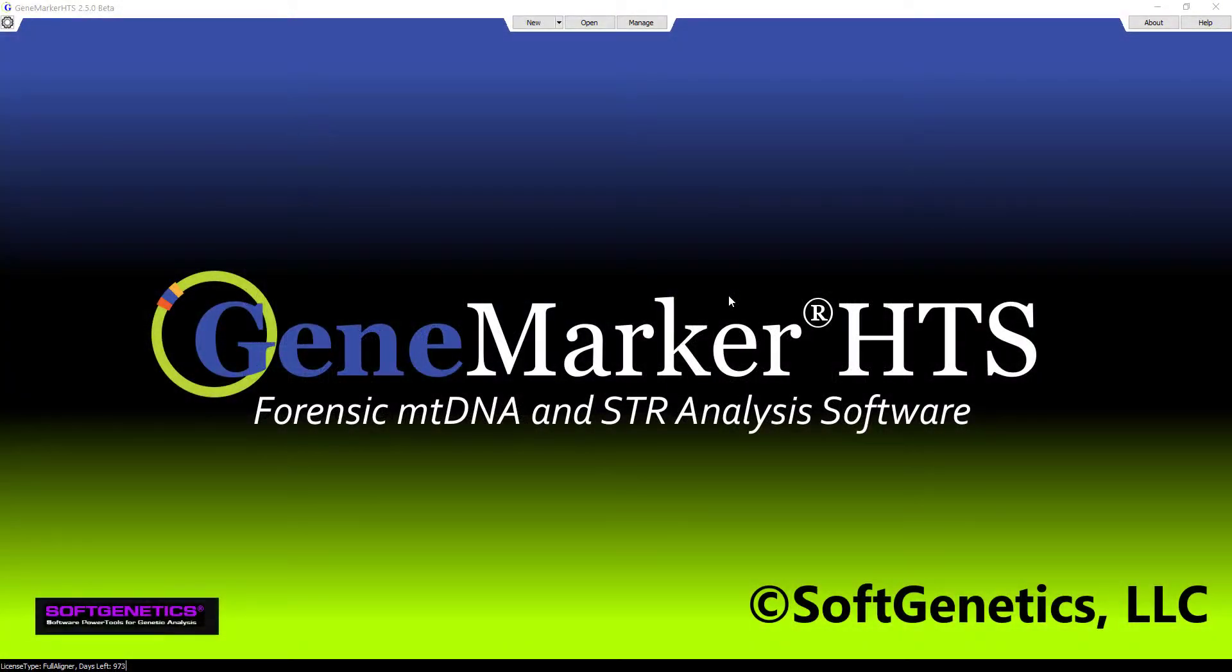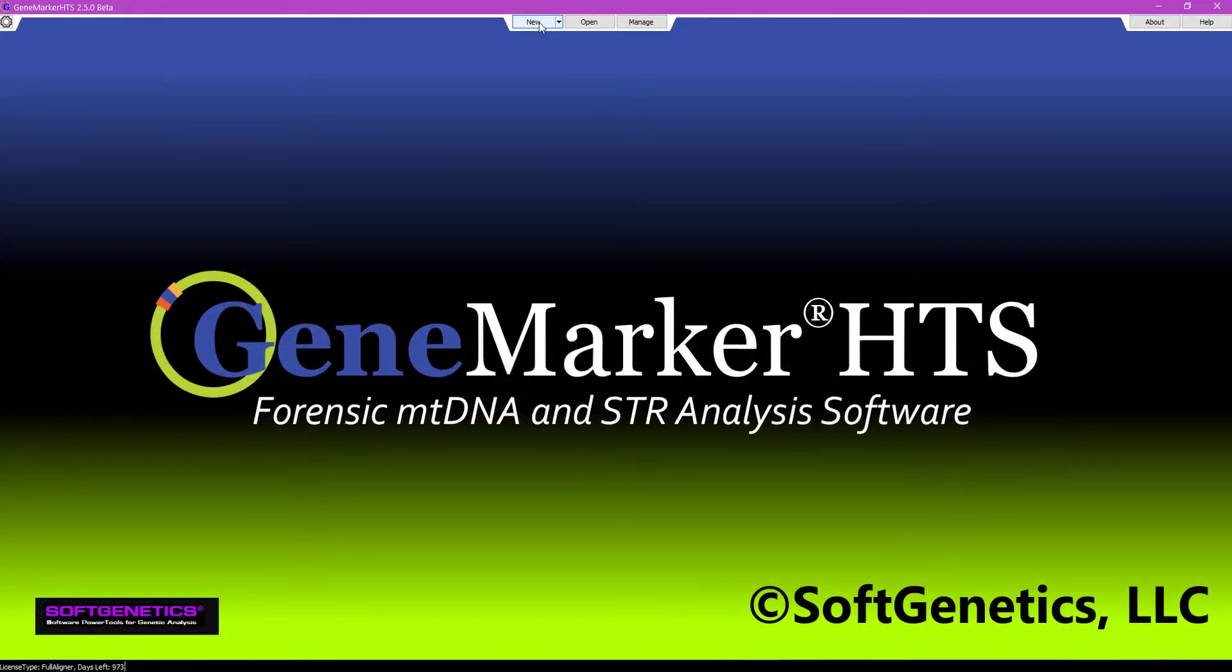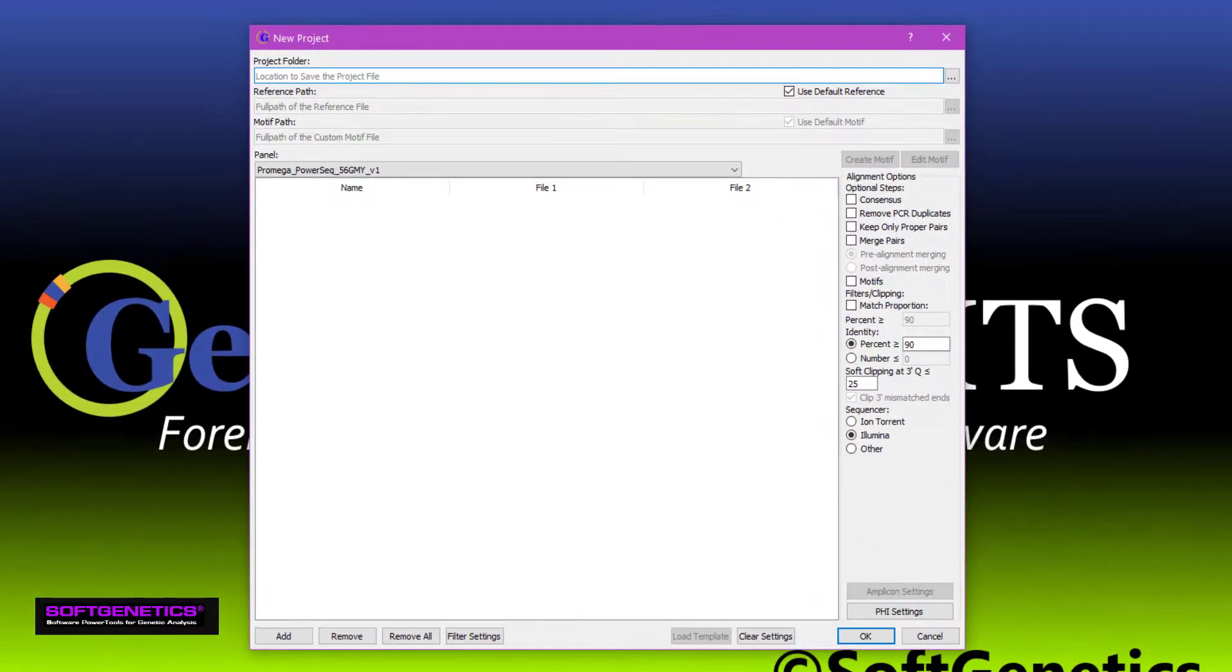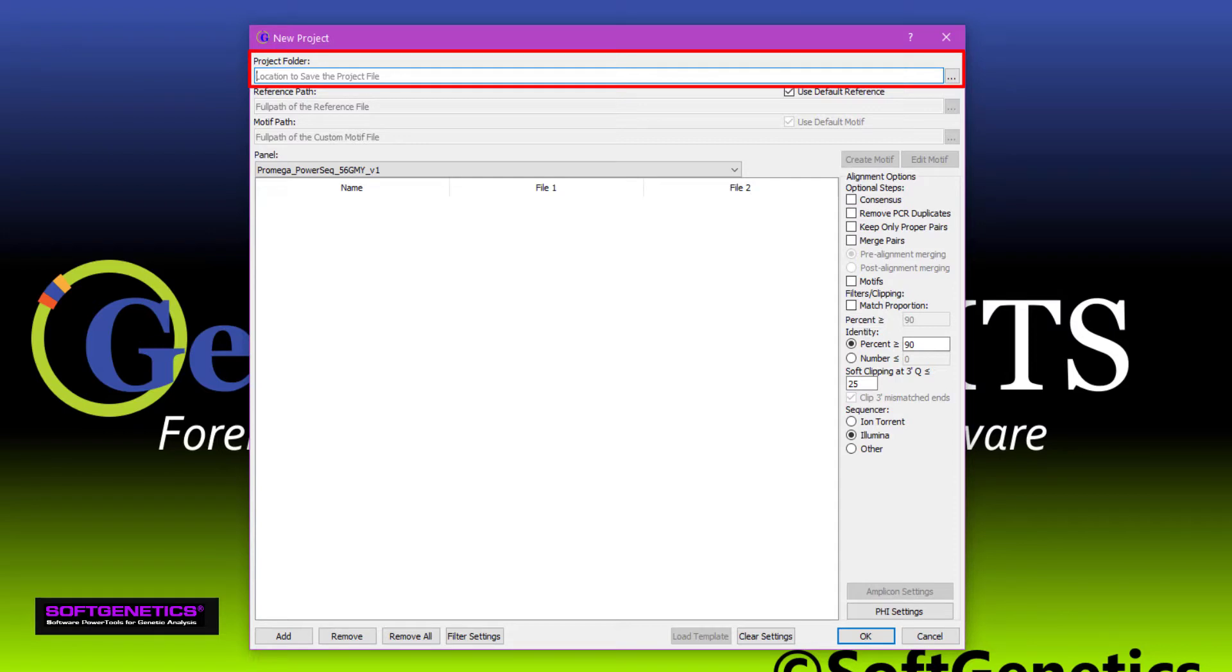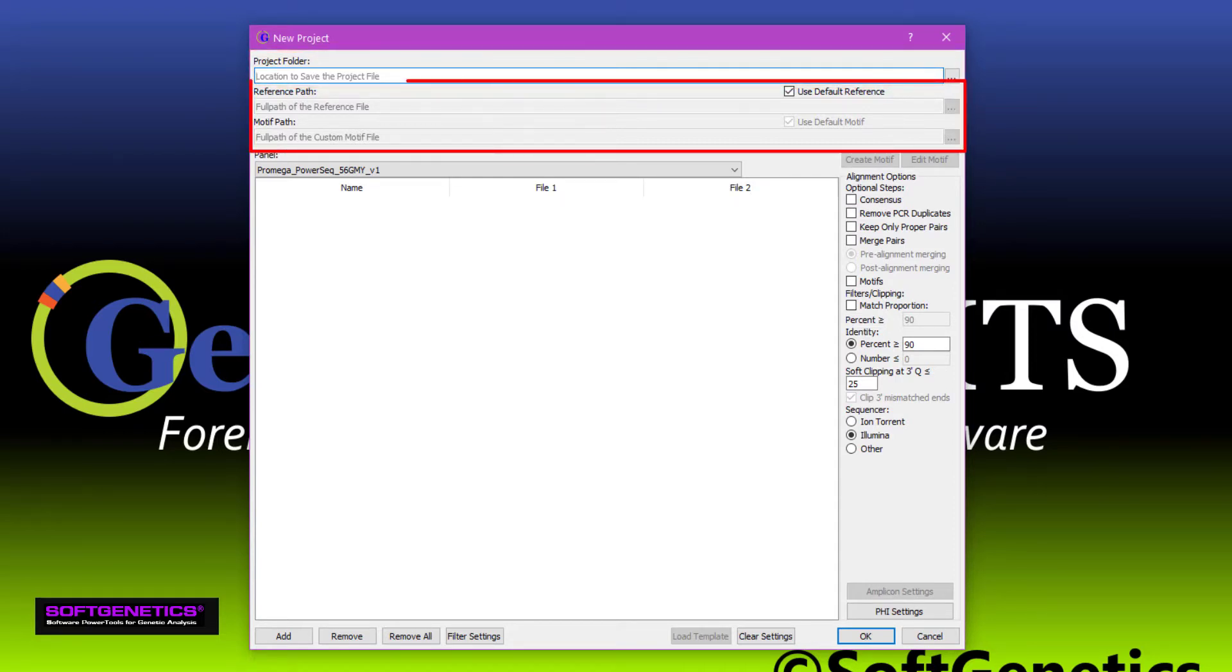To start a new analysis, click New. Enter a location to save your reports. If nothing is entered, the program will create a new project folder within the data folder where all of the reports and files will be saved. The reference and motif fields, as well as the alignment options to the right, are for mitochondrial data analysis, so we can disregard those for now.